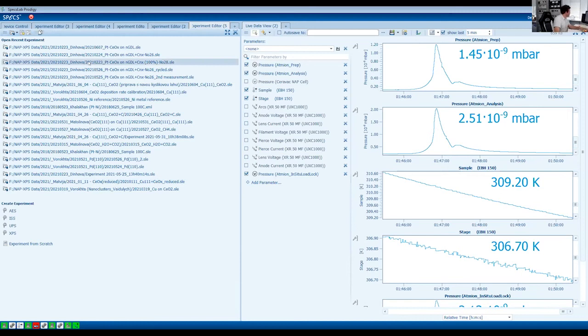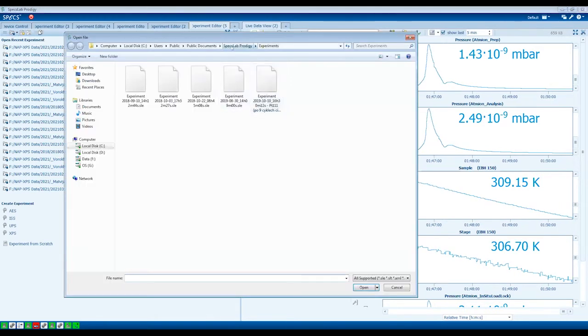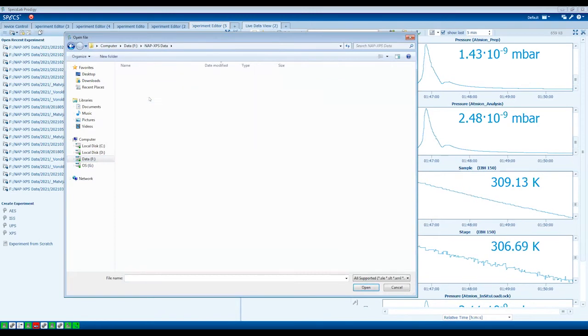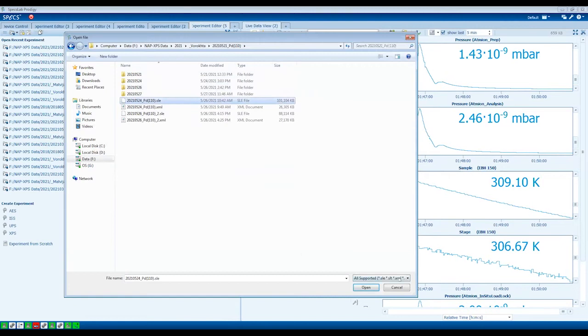I didn't open the file yet, right? Okay. So you can say new file, or maybe open Palladium. You can open the previous one and it's Palladium. Go to my folder. There is Palladium. You can open one of that.